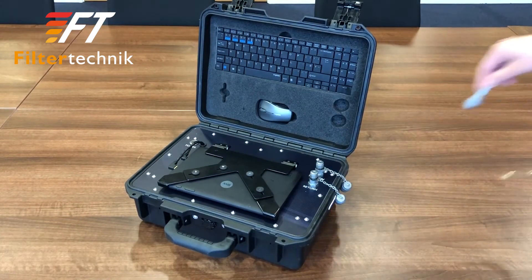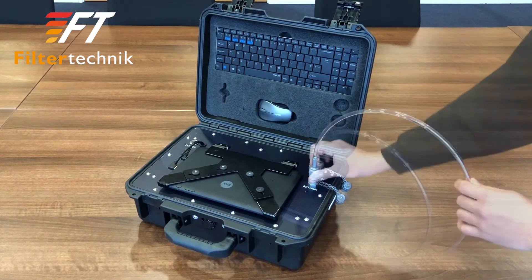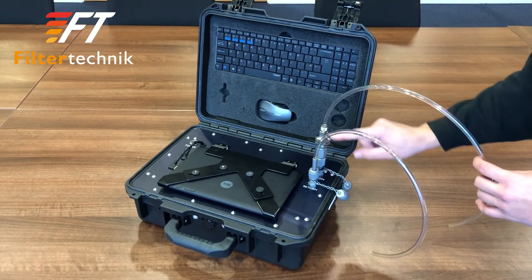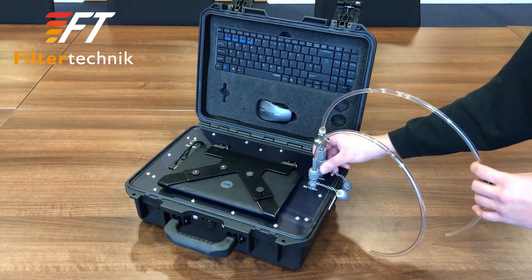To set the unit up ready for a test, start by connecting the sample hoses. Remember to always use the hose with the suction strainer as the inlet. Ensure that each test point is firmly connected to prevent air leaks.